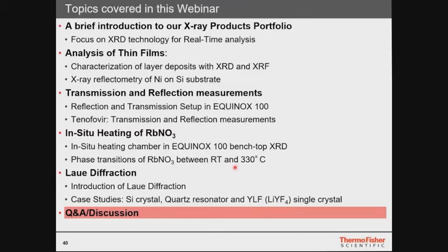Mirrors, on the other side, use the total reflection of the X-rays, using a similar principle to monochromators, with the total reflection angle also depending on the wavelength. This allows you to separate K-alpha from K-beta radiation, for example, and you get high flux. So you have two sets of reflections left, K-alpha 1 and 2, but you have very high intensities and shorter measurement times.